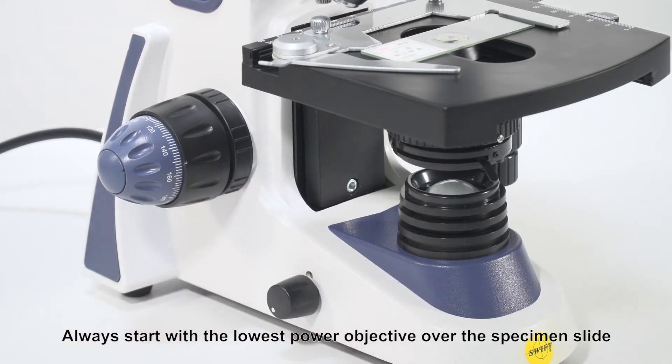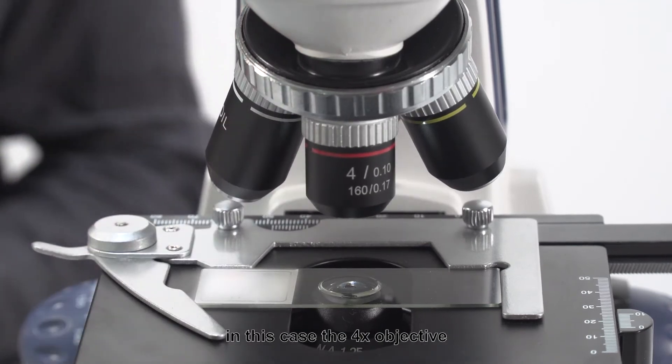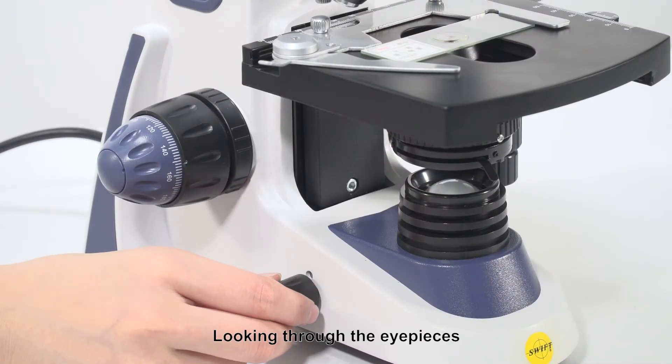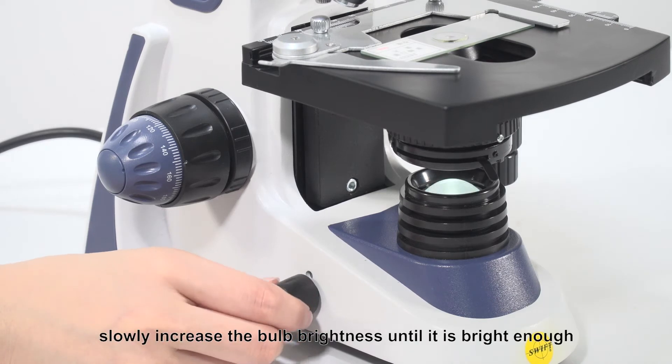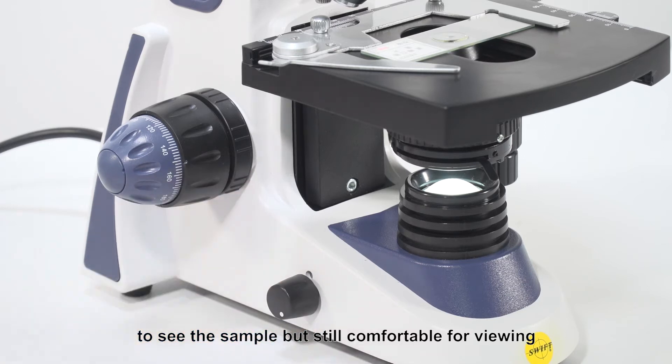Always start with the lowest power objective over the specimen slide. In this case, the 4x objective. Looking through the eyepieces, slowly increase the bulb brightness until it is bright enough to see the sample but still comfortable for viewing.